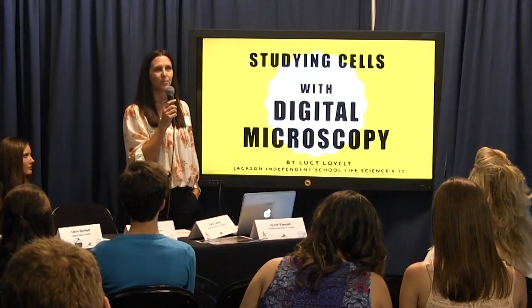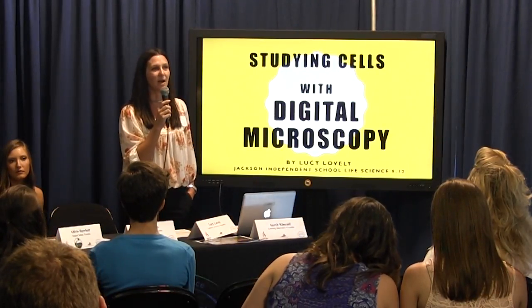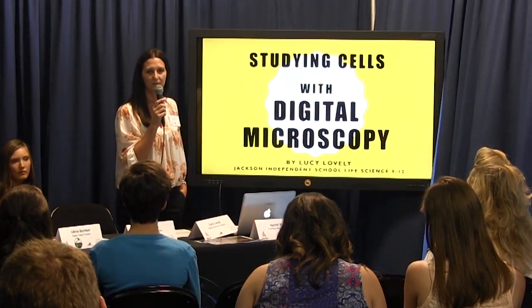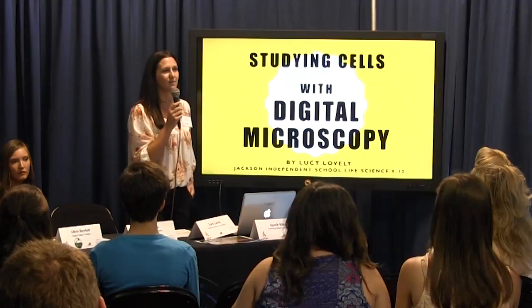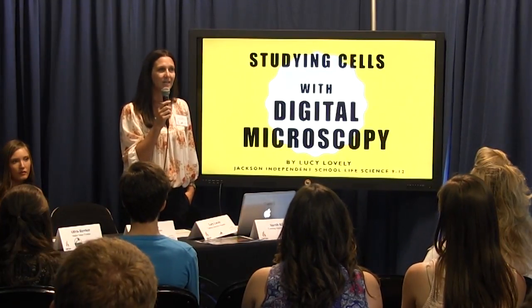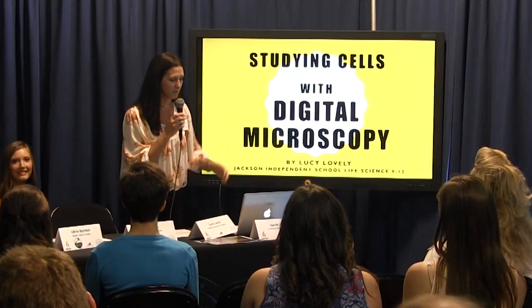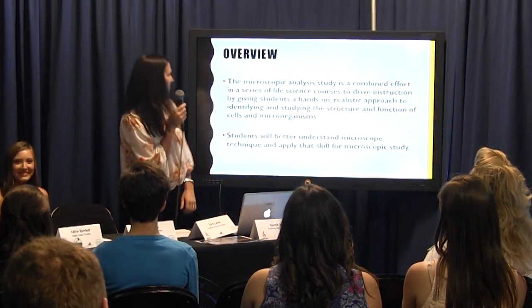And pretty much the entire first semester, we do a lot of work with microscopes. It's basically a mini microbiology, half the year spent doing micro. Over the years, I've encountered a lot of problems with students using microscopes, not just the technique, but a lot of times they just cannot find what they're supposed to be looking for, multiple issues. But anyway, we started out with that.